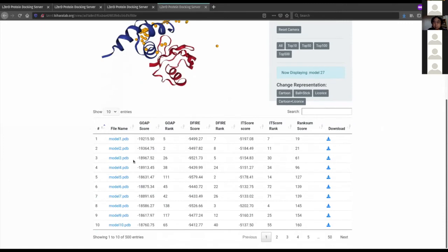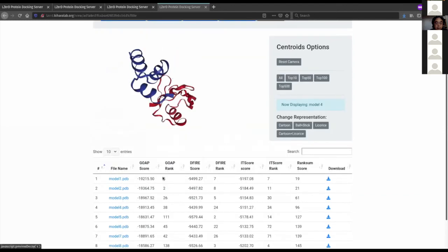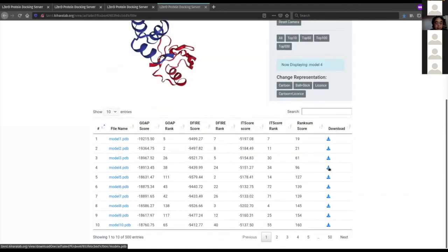Scrolling down, there's a table where each model is scored according to rank sum rank aggregation scoring. The models are already ordered by rank sum, so model one is always number one by rank sum. You can also open models individually or download models individually using the download column.